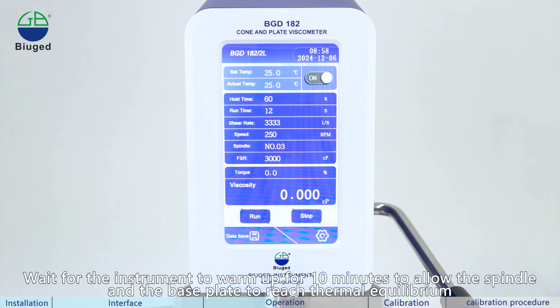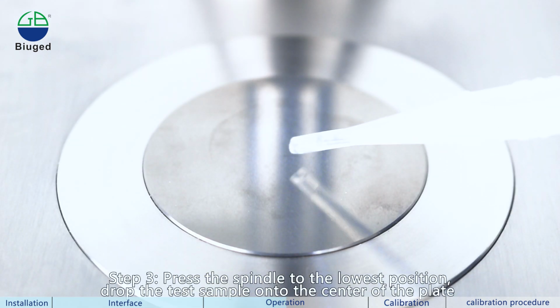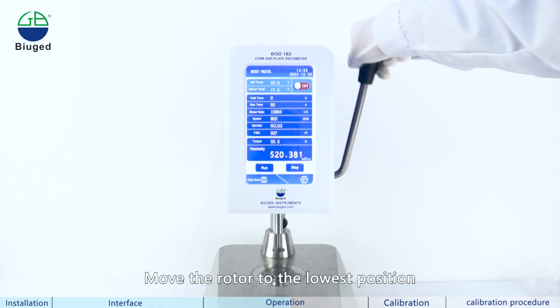Wait for the instrument to warm up for 10 minutes to allow the spindle and the base plate to reach thermal equilibrium. Press the spindle to the lowest position. Drop the test sample onto the center of the plate. Move the rotor to the lowest position.